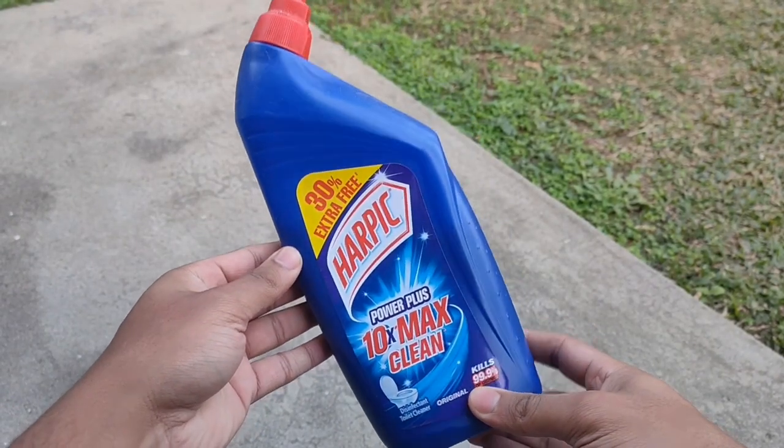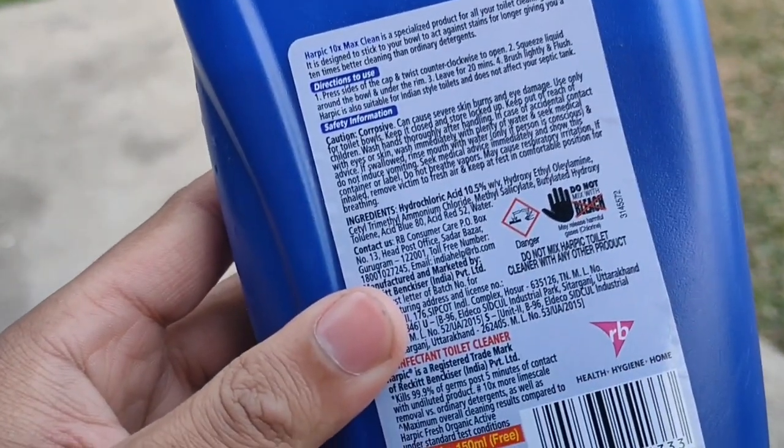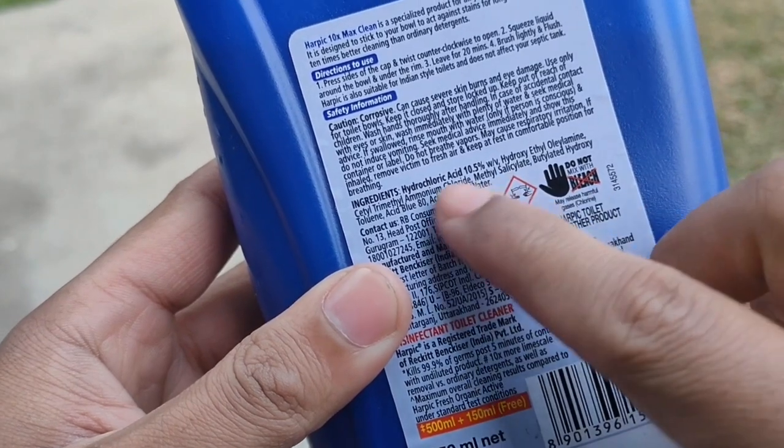At first we'll take a toilet cleaner which contains hydrochloric acid. As you can see, it's written here.